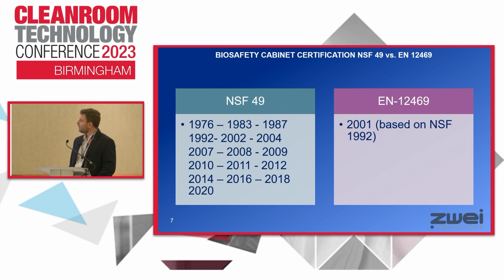And when we're reading this standard and you compare, it's a truncated text, very truncated text of 1992. What is missing is a lot of the ambiguities that clarify the right way to do the test so as to have a reliable test on the biosafety cabinets.